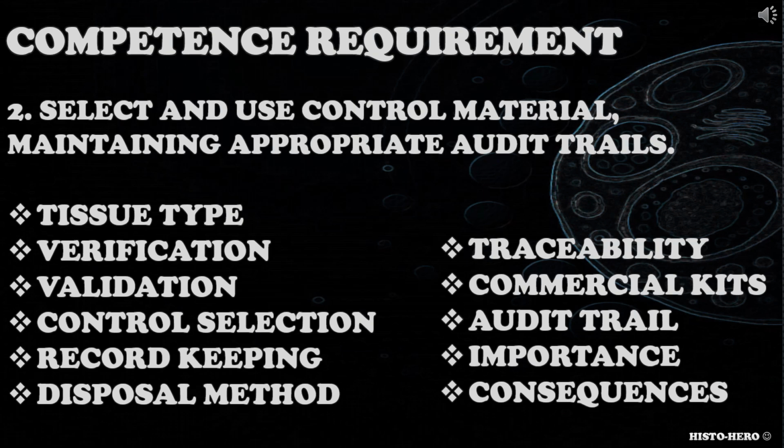When addressing this competence requirement, the candidate could consider tissue type and availability, verification and validation of control material, selecting correct control material, commercial kits available and their control material, record keeping, traceability, audit trail, consequences of not using correct controls.